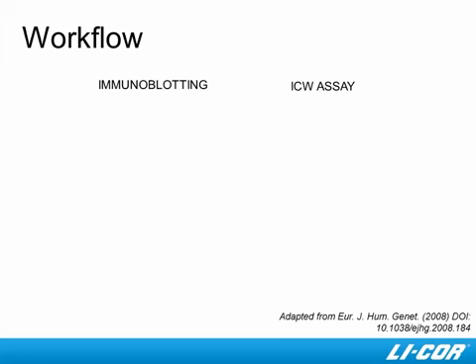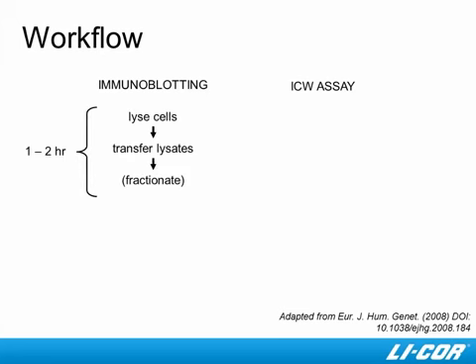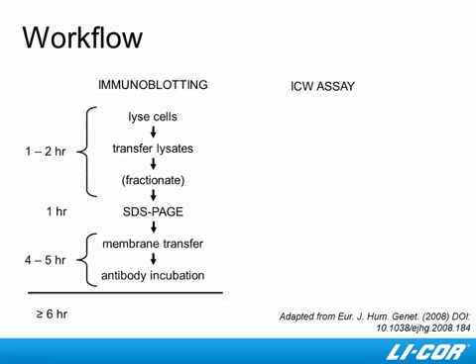Now, let's compare a workflow for a traditional Western blot to the Incell Western assay. If you do these types of assays with a traditional Western blot, you culture your cells, you do your incubations, remove media, and then lyse the cells. You then transfer that lysate to Eppendorf tubes and perhaps fractionate. Once your samples are ready, you then run them on SDS-PAGE gels, transfer the protein to a membrane, and then you start doing your blocking and antibody incubation steps. With a traditional Western blot, these are a lot of steps that can be very time-consuming for you in the lab.